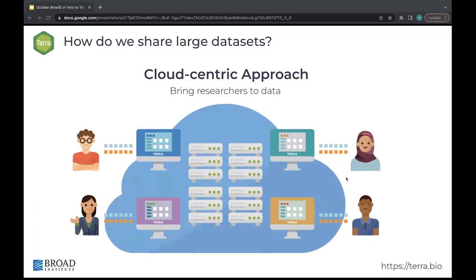A cloud-based model for bioinformatics looks more like this. Data rests in a central repository in the cloud where researchers access and analyze together in a virtual environment. With this new vision, you get cloud-based storage, which is true immediate data sharing. You only pay for a single storage instance that many can access, and you have shareable tools and containers, which means the results are reproducible.